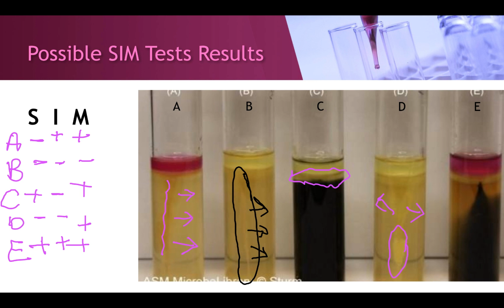We get a lot of information from the SIM test. And please keep in mind that each one of these would have been inoculated with a needle right down the middle, and the needle would have been carefully removed right along the stab line.